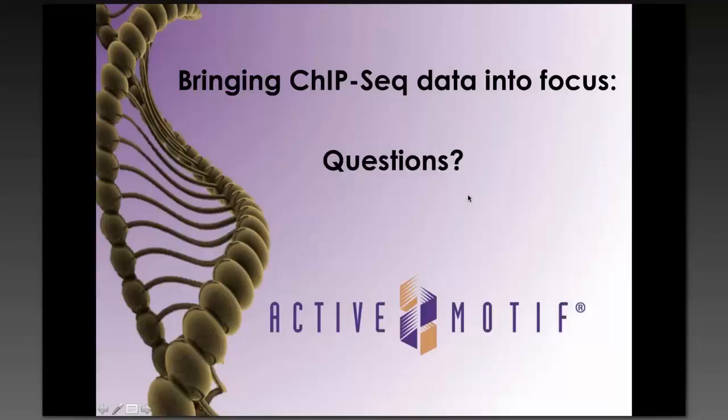After the ChIP, what we're pulling out. Yeah, and then going into sequencing. So not starting at your ChIP, but starting at sequencing. I think the idea here is that once you've treated it with the EZH2 inhibitor, that reduces the amount of recovered DNA. So if you were to normalize that, would that fix your overamplification issue, do you think?